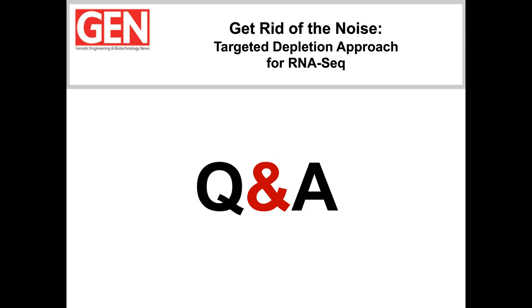Okay, great. Thank you, Ashesh. Maureen, another question for you. Can Solo libraries be sequenced on any Illumina platform? Are there any deviations from standard Illumina sequencing parameters? Yes, so we have successfully sequenced Solo libraries on both the MiSeq and the NextSeq instruments from Illumina. They sequence well.